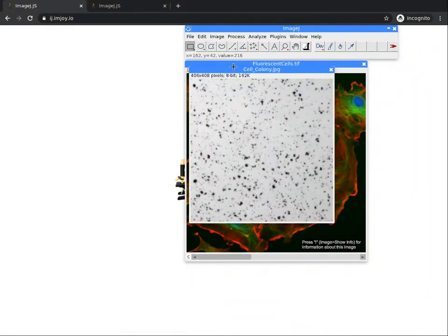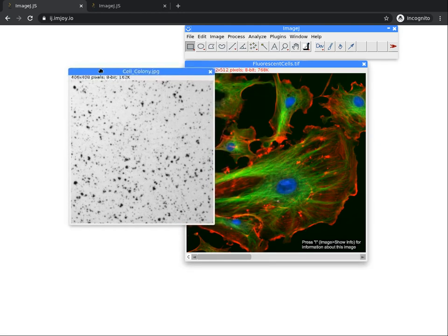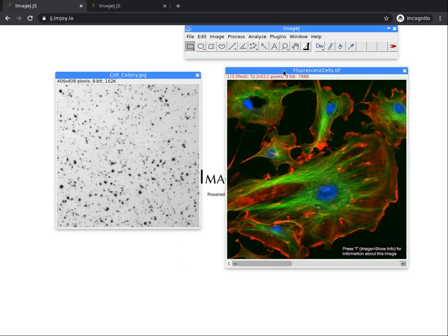If you have a black and white picture, it is essential to modify the contrast, the brightness, etc. of your picture to really differentiate your object. If you have a picture with colors and you have different information on each color, it is important to keep the three colors, or the three channels, separated to not mix the information of each color.